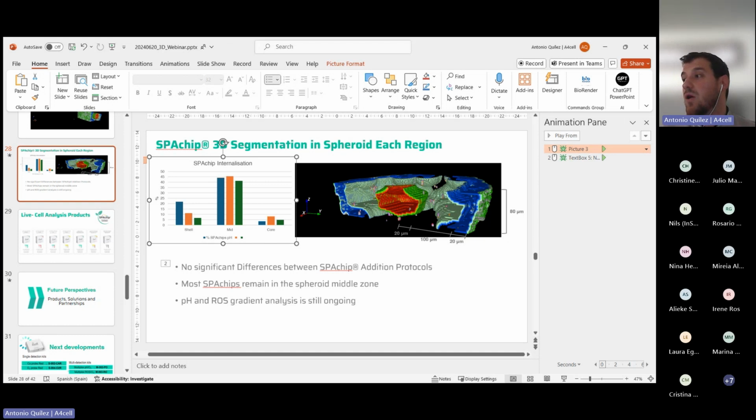Also, you could preload the T cells with a SpheroCHECK kind in a different color, so you are able to discriminate those two. So that's how I would do it. I would be very happy to see an application like that. So we are looking for users or people who want to test it out and publish. We'll be glad to discuss.